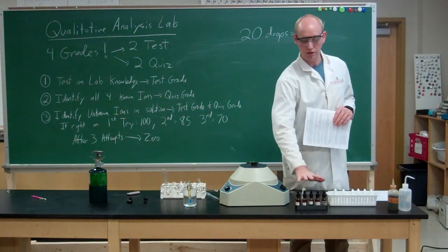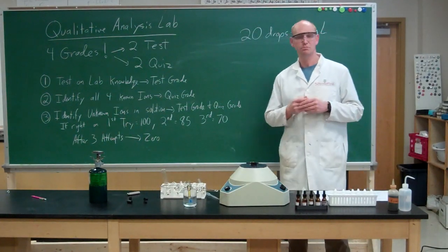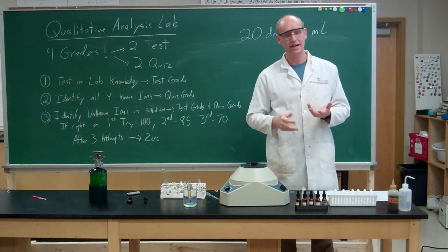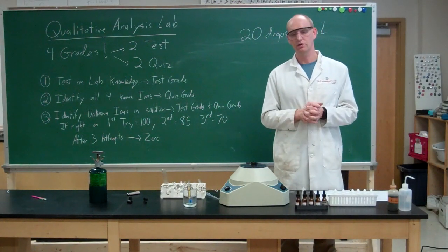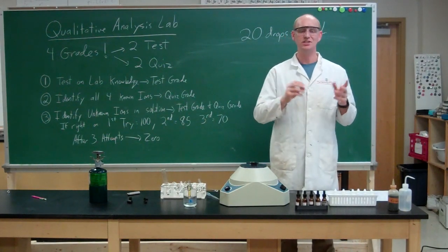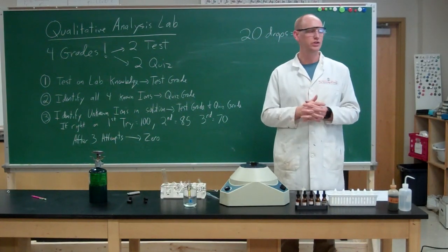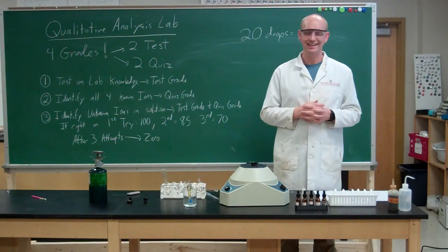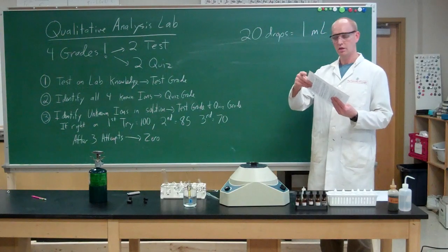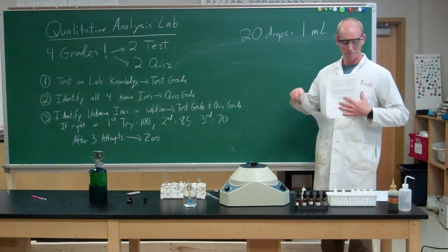But you do need to know your indicators. So you need to know which ion your barium chloride is used for. What ion is your dimethylglyoxime used for? You need to know which indicator might cause fluorescence. So you need to know what ion each indicator is used for and which indicators are used for each ion. We may ask you, how do you find aluminum? Or we could ask you, which ion will 8-hydroxyquinoline indicate. So that is all in our procedure, particularly all the indications on the back.